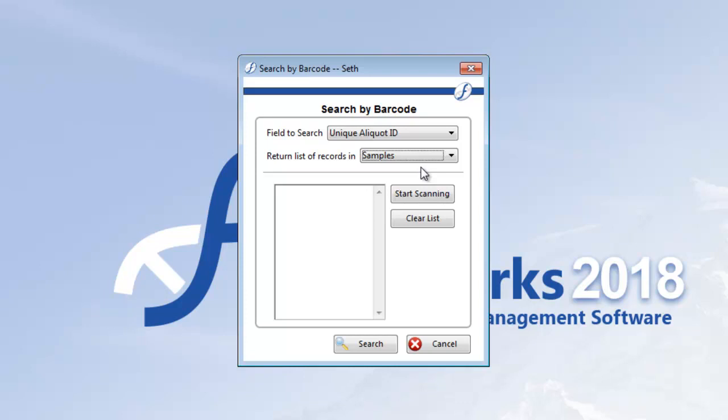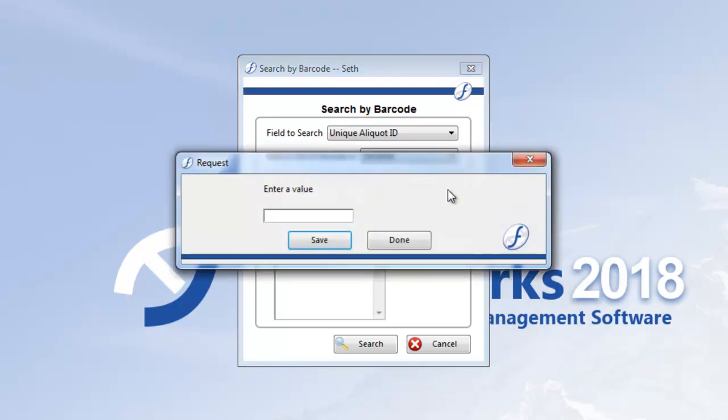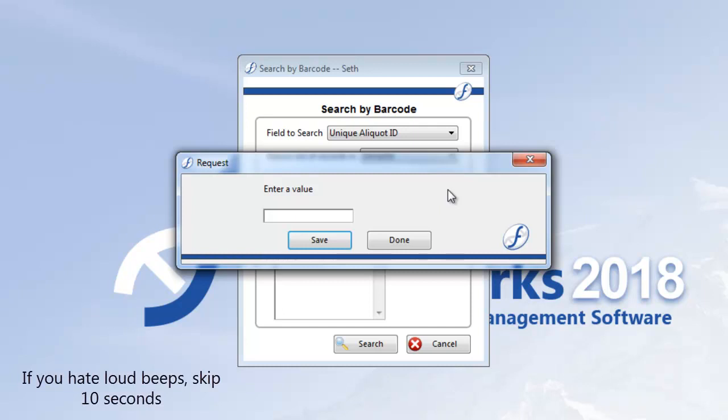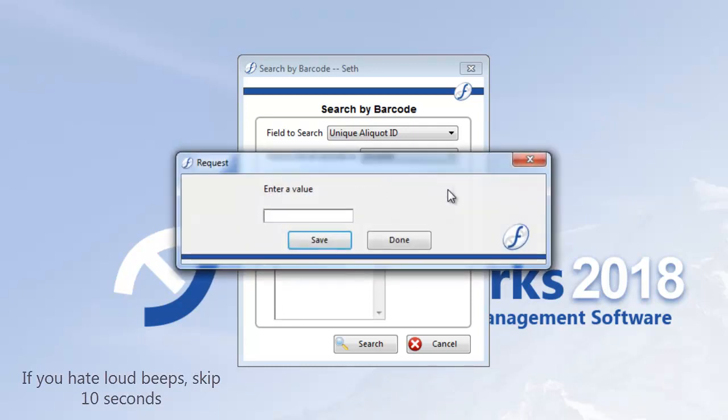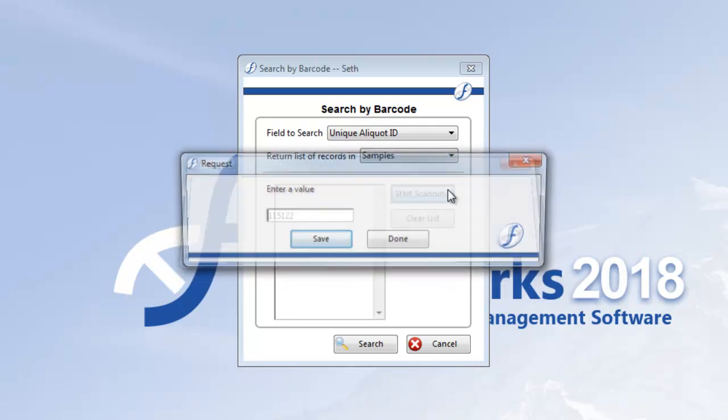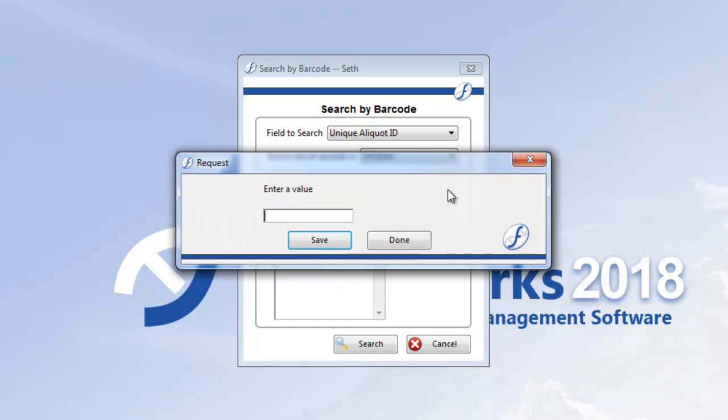For now, I'll leave it on samples and click start scanning. An enter value box will appear. This is where you'll pick up your scanner and quickly start entering each vials ID for searching. Your scanner should automatically hit the enter key so you don't have to stop scanning until the job is done.